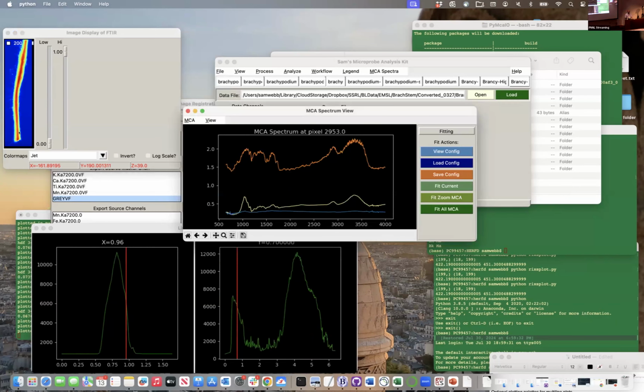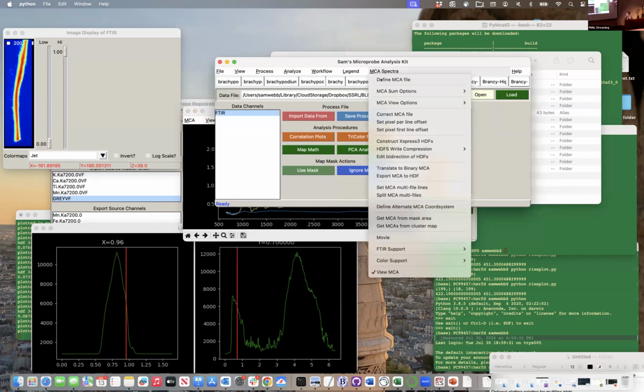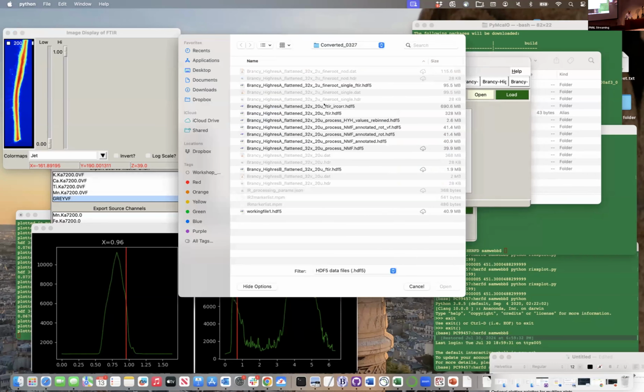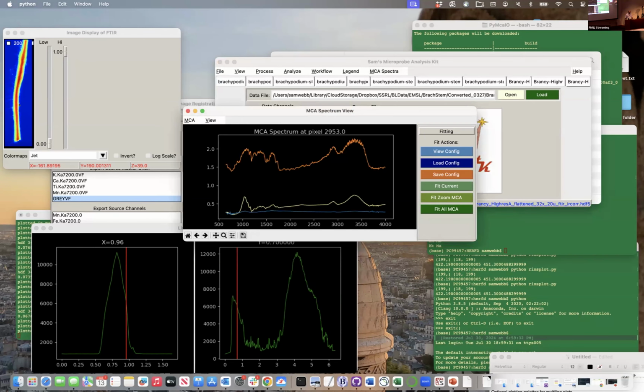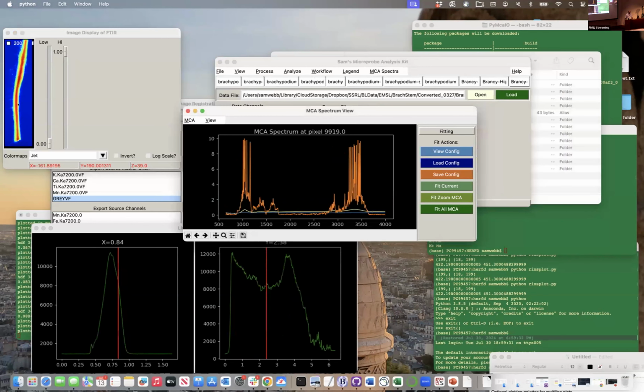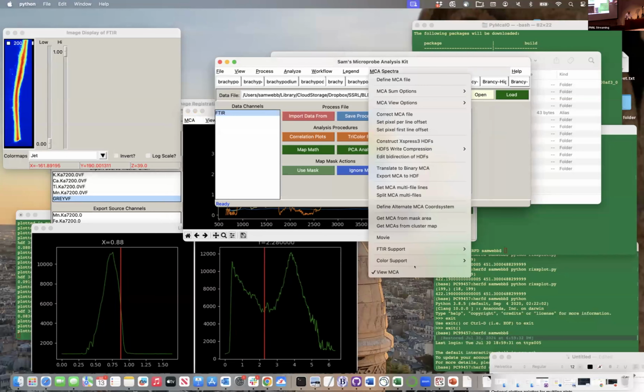This is not the background subtracted data. I'm not going to go through that whole process, but it's safe to say that when you background subtract your data, you get a new file that has IR corrected. Now if I double click on these places here, I will get my background subtracted data instead. That's a high point. There we go. So I can now go through the other ones and redo it. This is the section where we can do those types of things, doing the background and corrections.